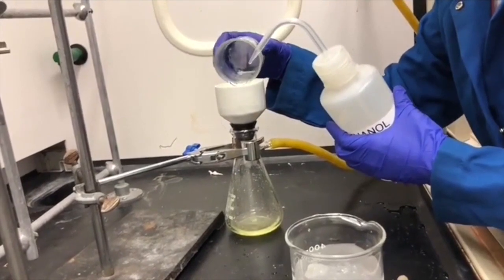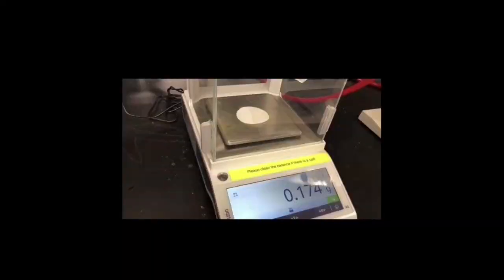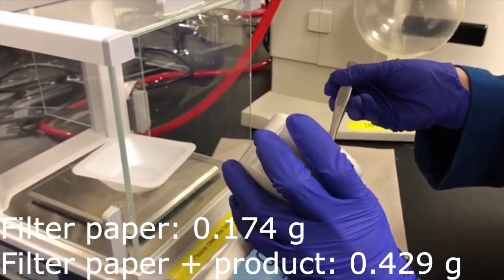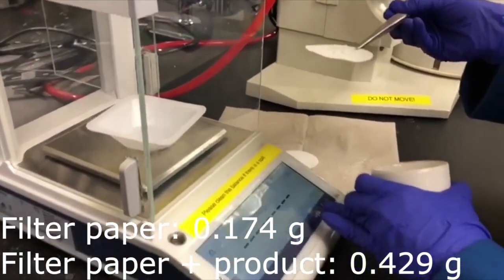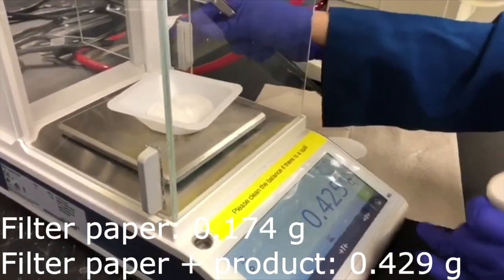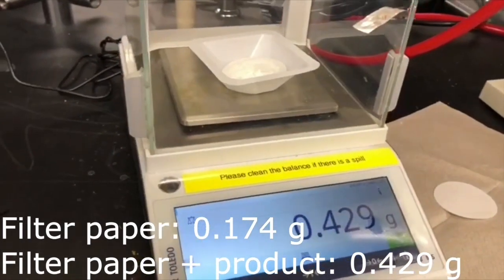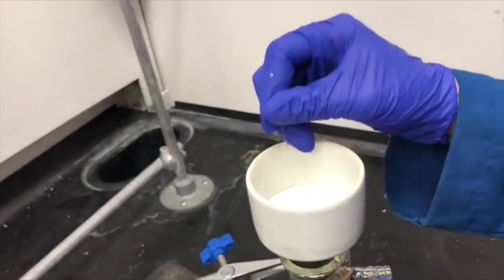Before we did the suction filtration, we weighed out the filter paper. And here I'm weighing our final product. Again, record this number to do your percent yield calculations. Getting our sample ready for melting point.